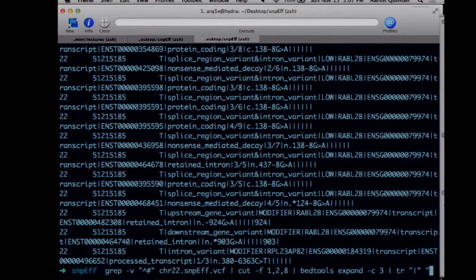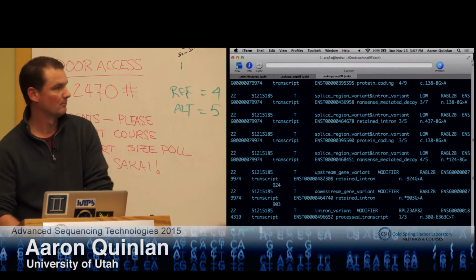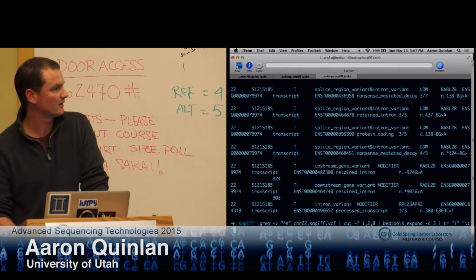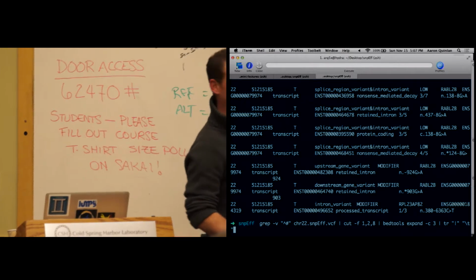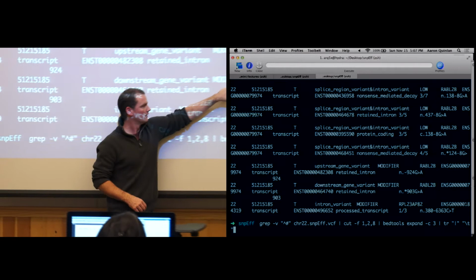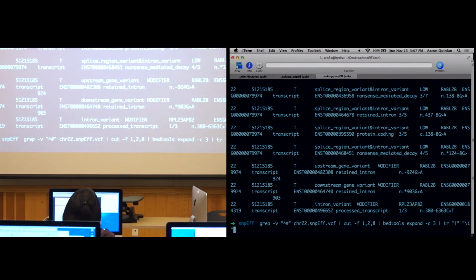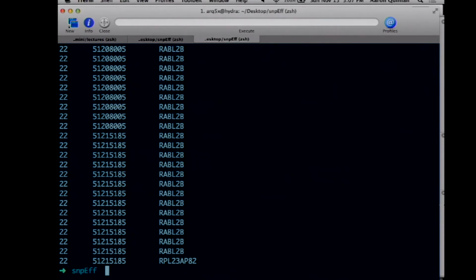And the way you say tab is slash, or is that a backslash? I think that's a backslash t. See, and it's all blown out into tabs, right? So now what we should do, what columns do we want to cut out now? We probably still want to keep these, right? 1, 2, 3. Yeah, so let's do 1, 2, 6. Okay, so that seems to be working.